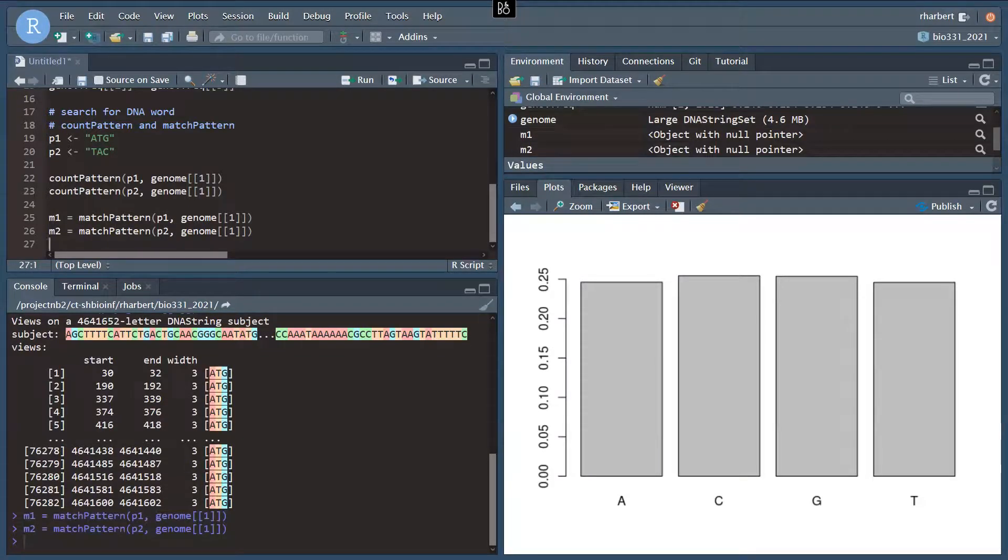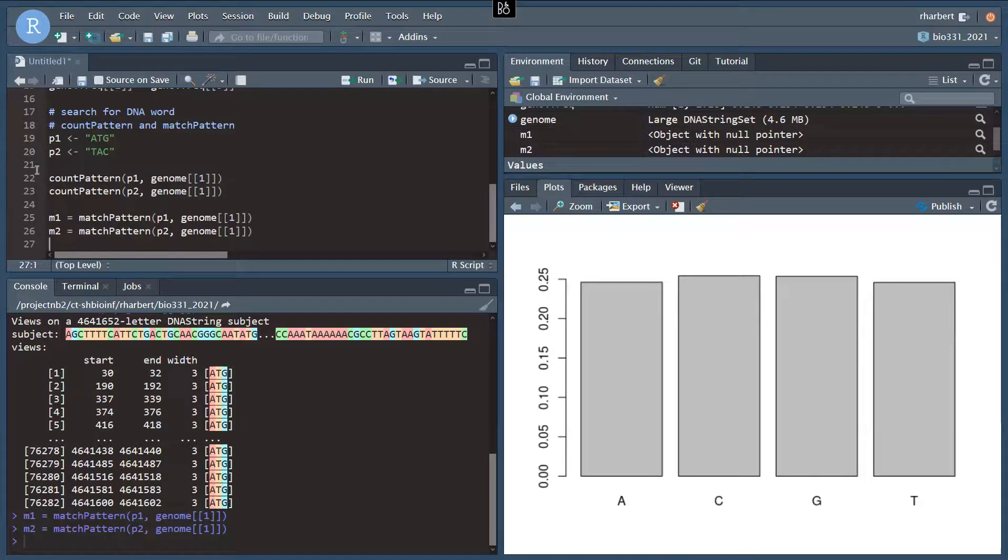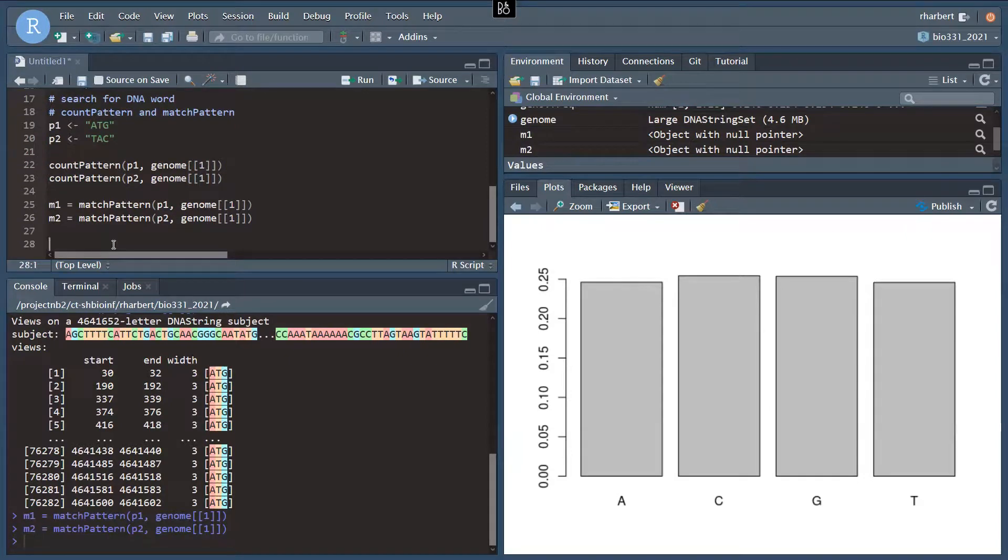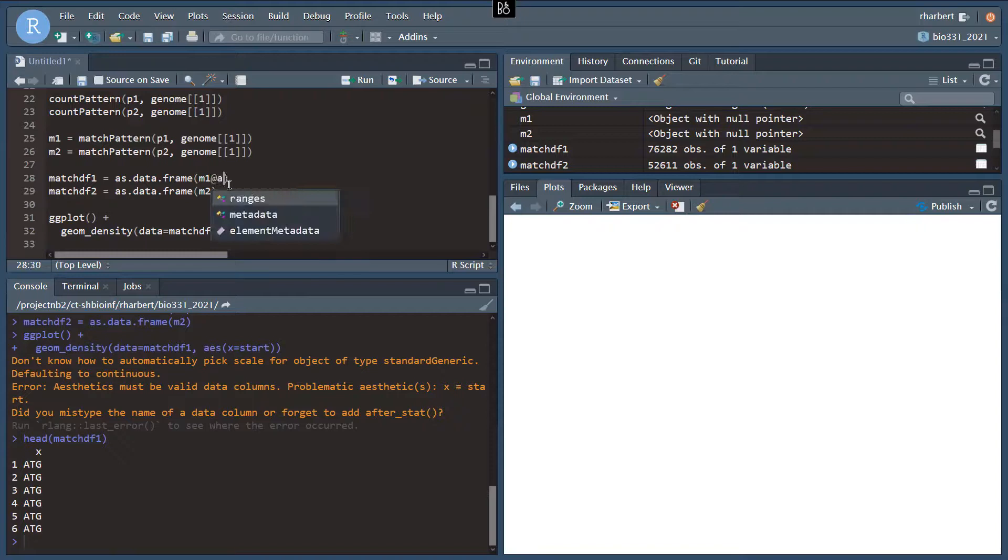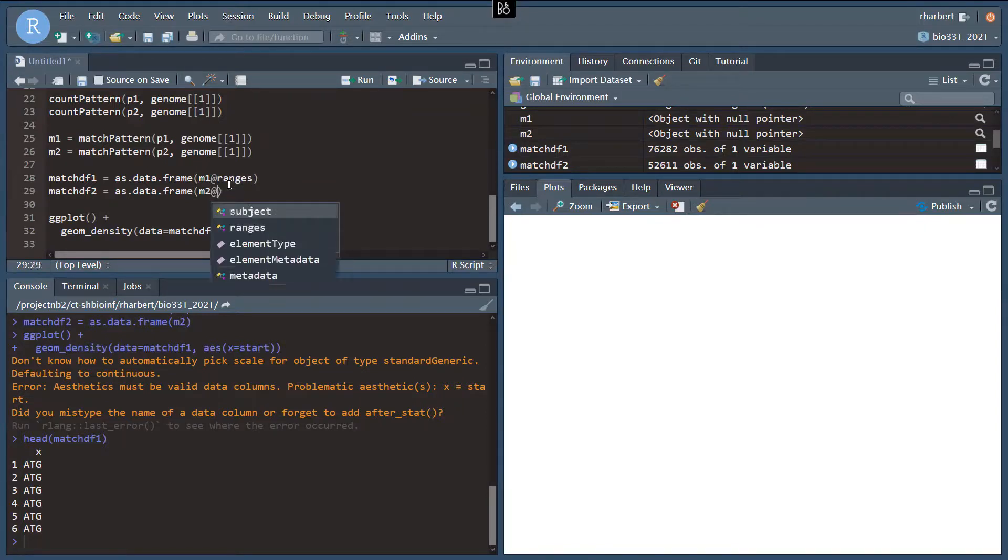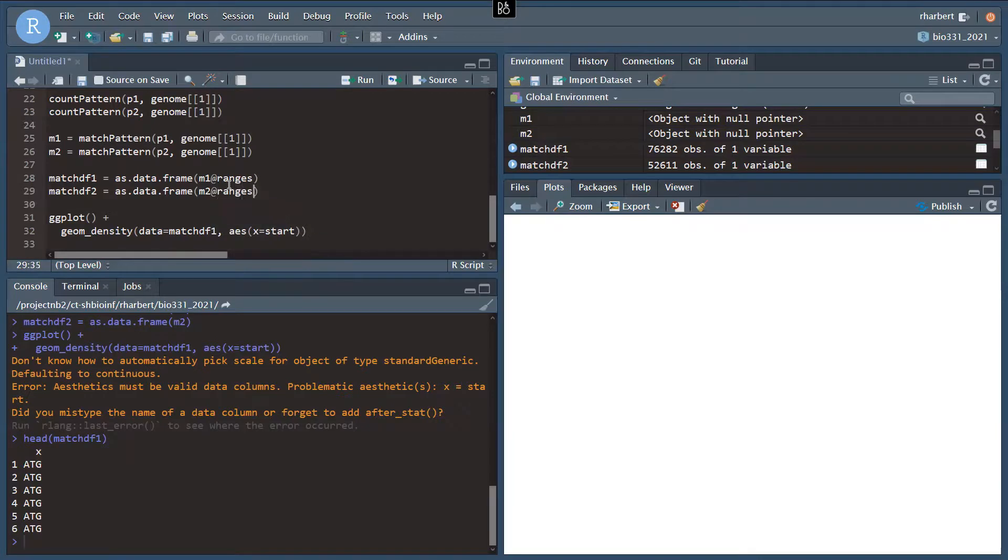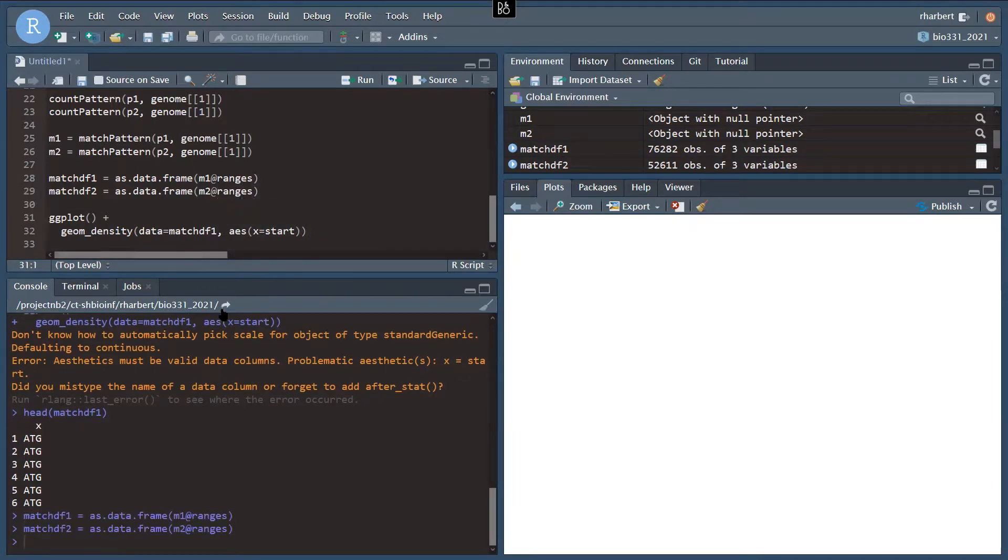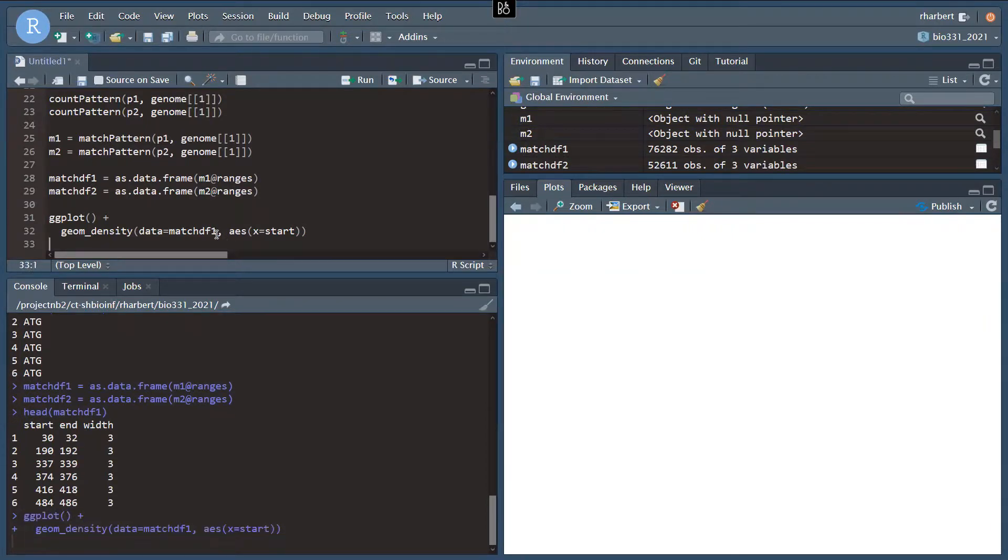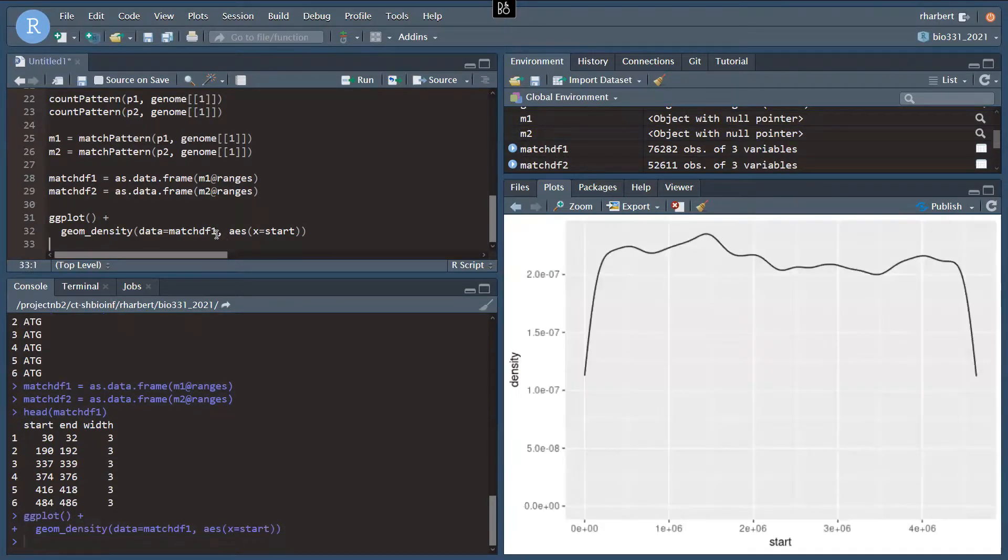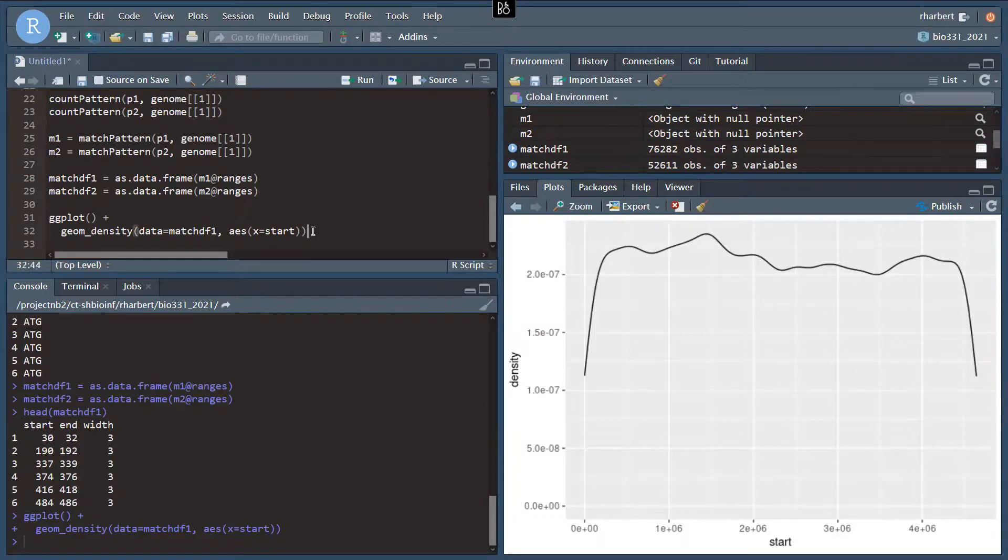And now I'd like to visualize this along the genome. So I'm going to need to convert these to a data frame and plot these with ggplot. So our problem there, M1, we need to get the attribute of the ranges. So we're going to do at ranges and M2 at ranges. So that's what I get for not visualizing matchDF1 and 2. Let's do that. Let's do head. There we go. Now it looks like a data frame with start, end, and width. And now our plotting ought to work.